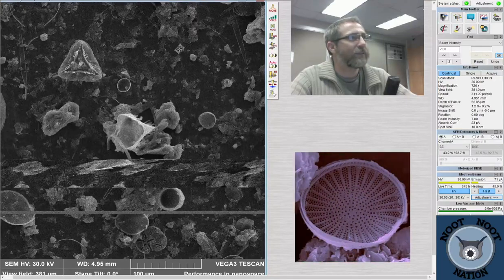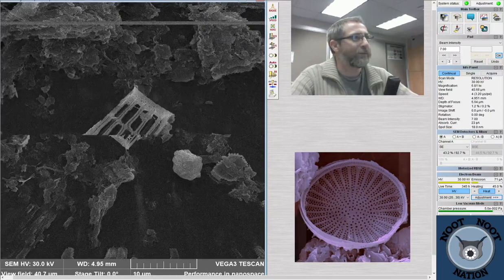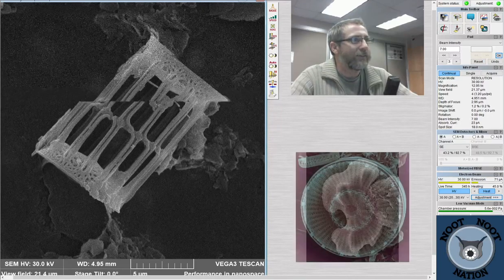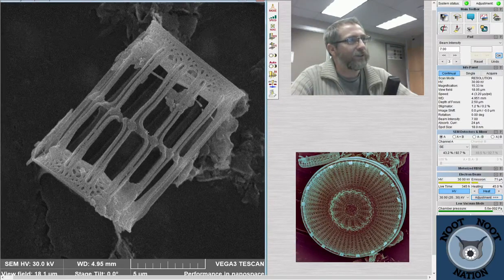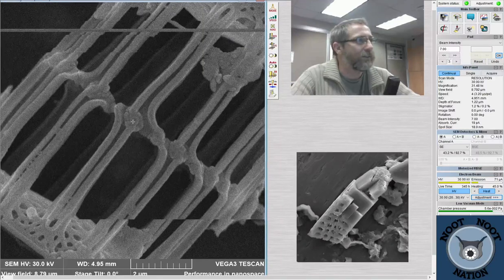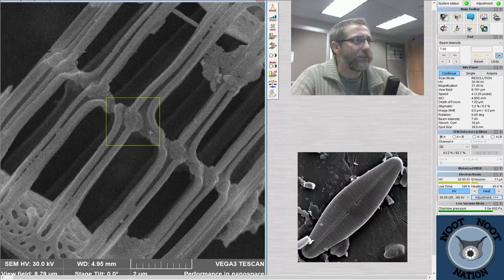Oh, this is going to be good. Down here, this little tiny guy right here is one of Pacific Plankton's favorite ones to see in the scanning electron microscope. It is Skeletonema. And Skeletonema have these sort of knuckled spines on the outside edge, so it looks like a trellis or something. But we can zoom in on that, and you can actually see that they're little knuckled spines that interlock with their sibling, the adjacent sibling cells. You can kind of see that knuckling right here. So there's a piece of one knuckle and a piece of another knuckle there.